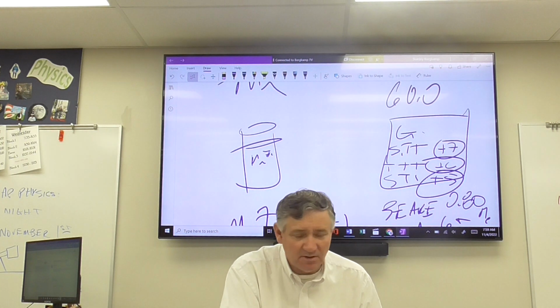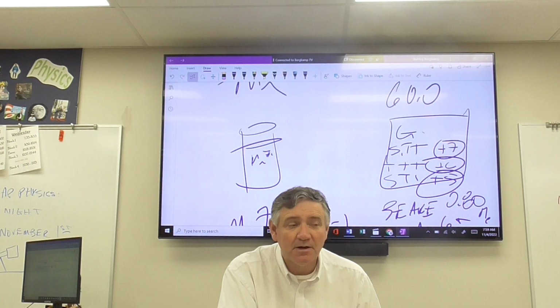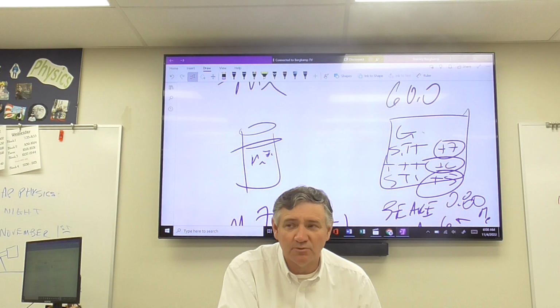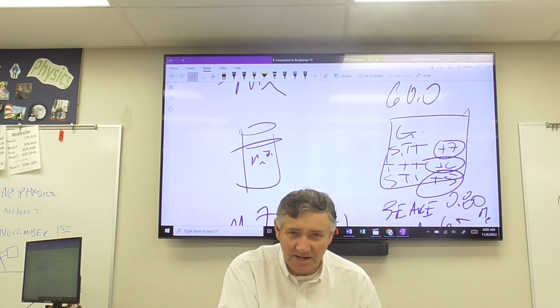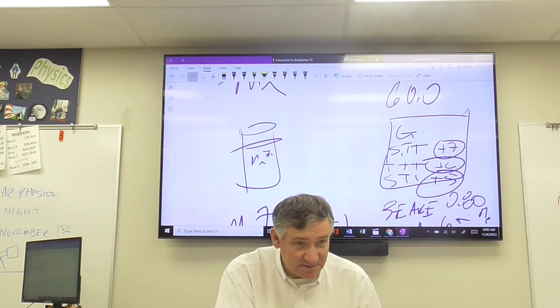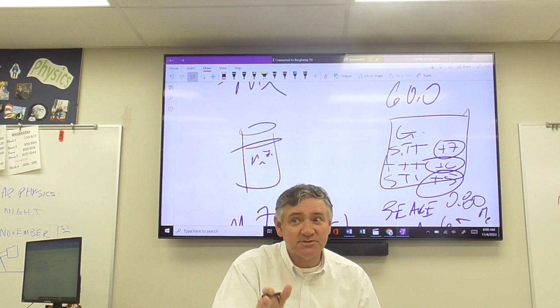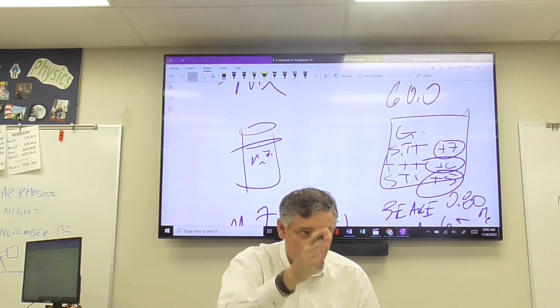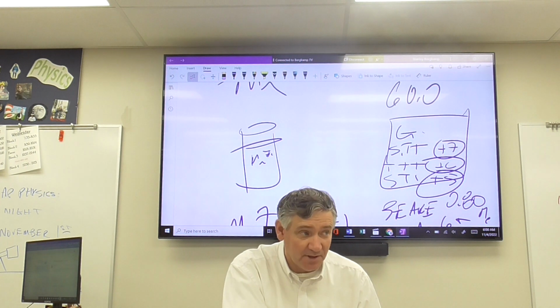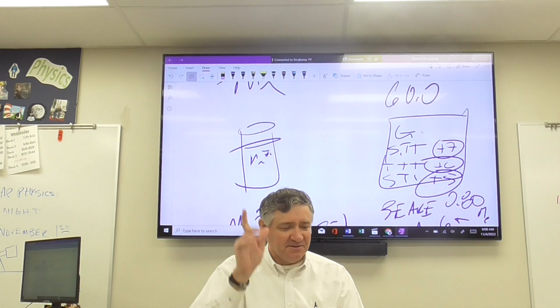So, this is the only time I will ever tell you this. I cannot guarantee the results of this lab, okay? But what I can guarantee you is that, so help me, if I see you without your glasses on, you will have no warning. I'm just going to send you back to this room, okay? Because it is that important in terms of the things that you're going to be dealing with. You don't have to have your glasses on when you're labeling the glassware, but as soon as you start to touch a chemical, you get those glasses on, okay? Are we good? Fantastic. I have great hope. Let's go do science.